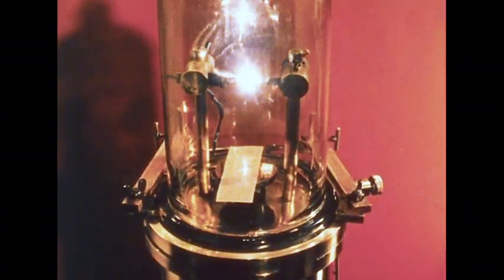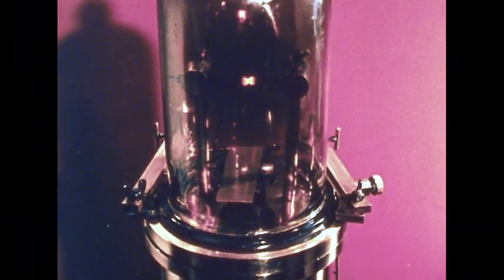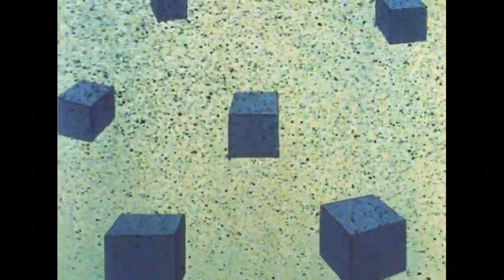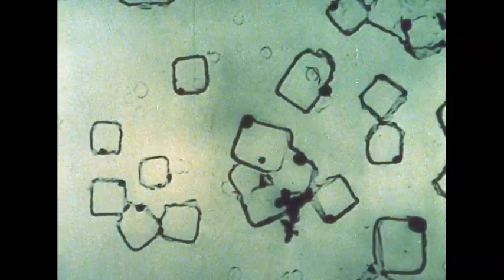But many specimens are too dense to be penetrated by electrons. If the specimen is put on a slide beneath the carbon rods, it is possible to make a cast or replica of the surface of the specimen. When a current is passed between the rods, the carbon vaporizes and then condenses all over the specimen, making the cast. Now the specimen itself is removed so that only the cast is left. The carbon cast can easily be penetrated by electrons. Yet an electron micrograph gives a poor impression of structure.